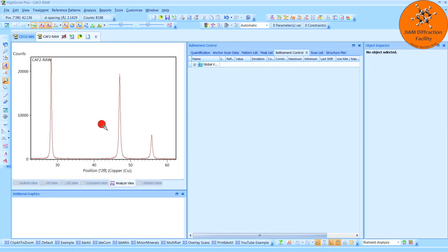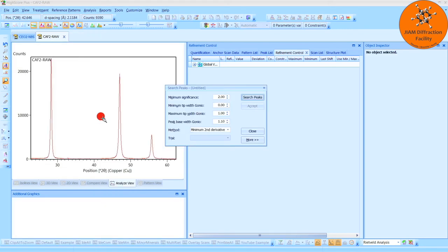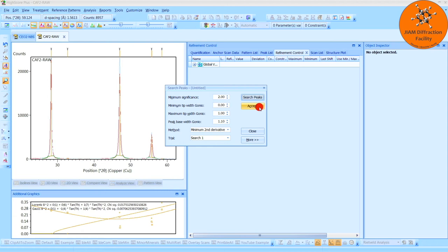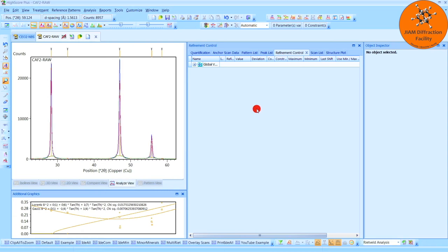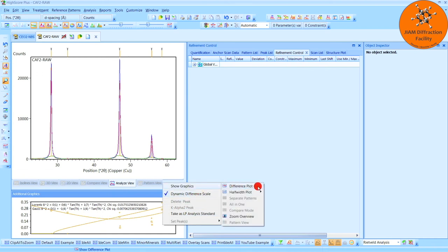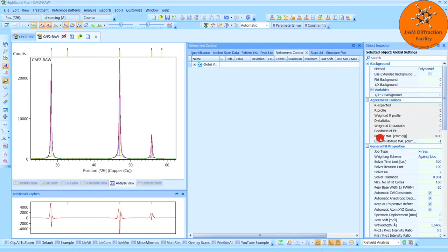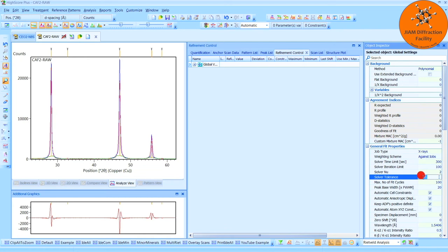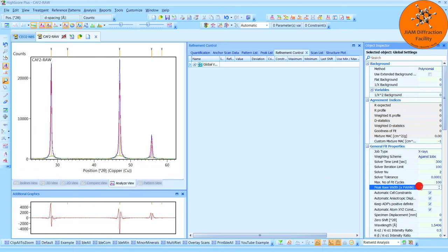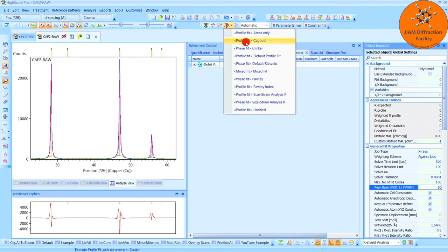I will then right click, Search Peaks. Click Search Peaks, and Accept. Before I perform my refinements, I will come down here, right click, Show Graphics, and left click, Difference Plot. I will come back here to left click, Global Variables, and once again make my solver tolerance a little more demanding by adding one zero, and I am going to go ahead and change my peak base width to 30, because I know that's going to work best for this sample, but once again you will determine what works best for your sample. I will hit Enter, and now we are ready to come up here and perform a default profile fit.